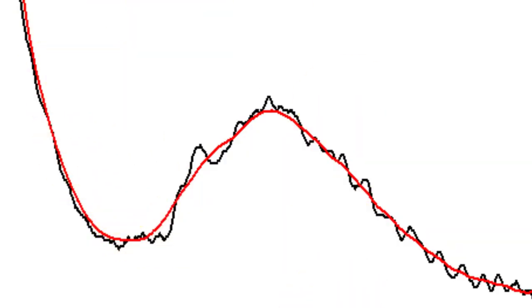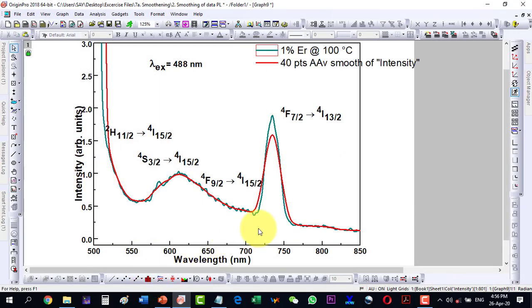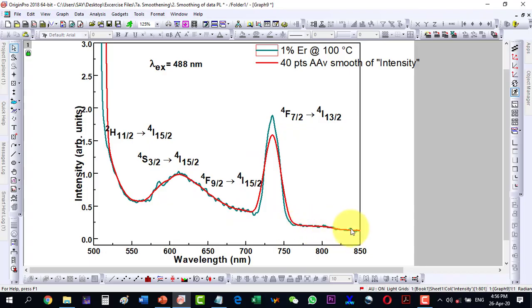This way we can smooth our plot very easily. We will have to check what kind of method is good for our plot, because for some plots one method works better than the other. That is how we can find the best smoothing approach for a given dataset.